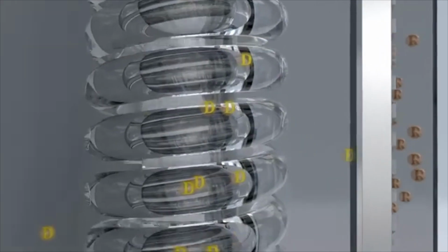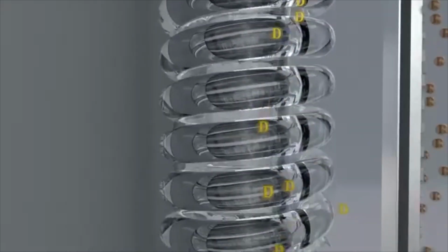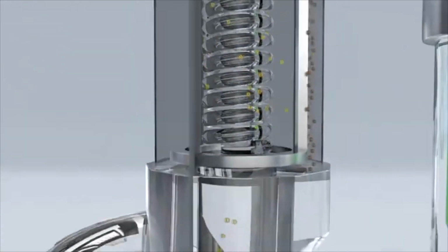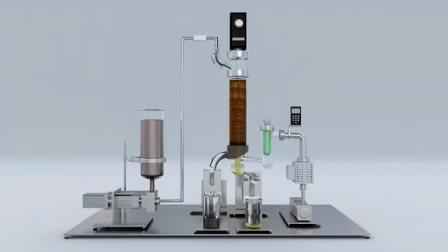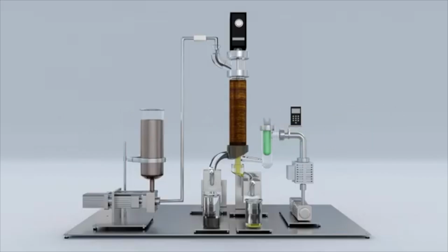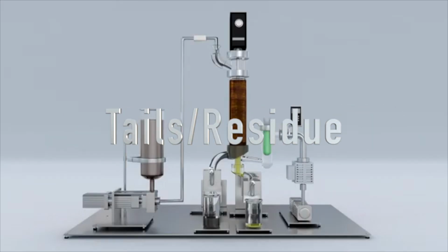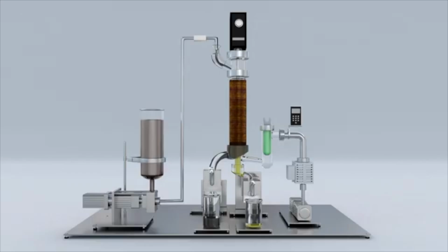Typically, compounds within the same temperature range are evaporated, condensed, and collected into what is called a fraction. These fractions are typically divided into three categories: the heads fraction, containing the compounds that evaporate before the target compounds; the main body, containing the desired target compounds, all of our money; and the tails fraction, containing the compounds that evaporate after the target compounds.